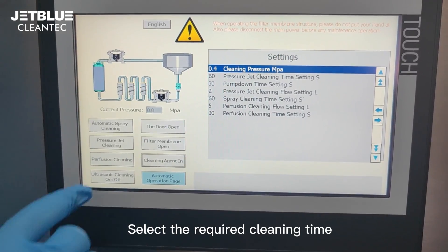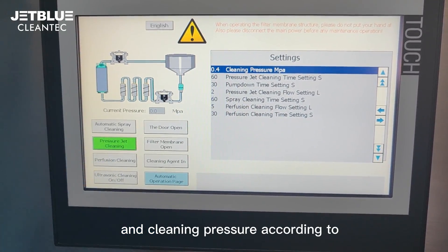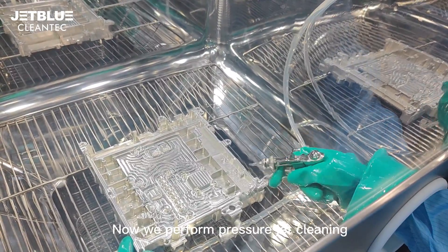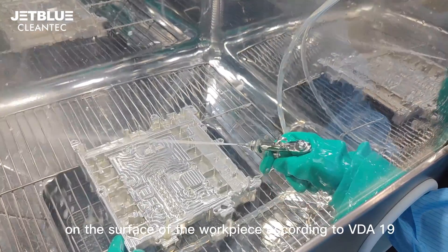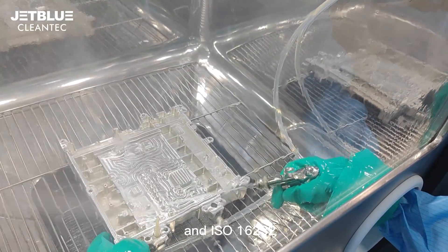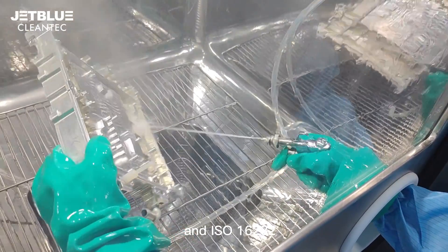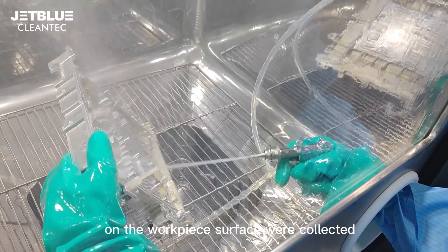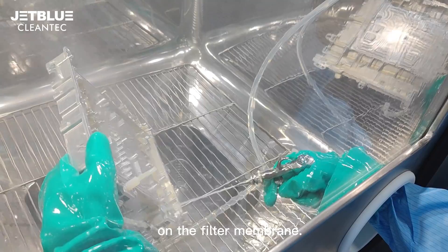Select the required cleaning time and cleaning pressure according to the flushing technical specification. We now perform pressure jet cleaning on the surface of the workpiece according to BDA 19 and ISO 16232. The tiny particles remaining on the workpiece surface are then collected on the filter membrane.